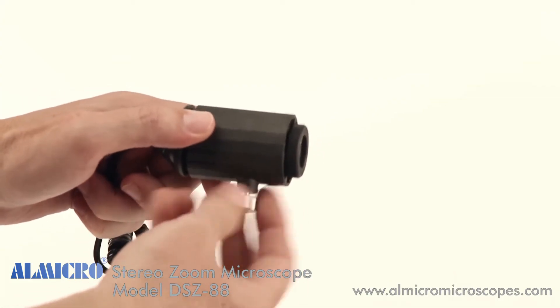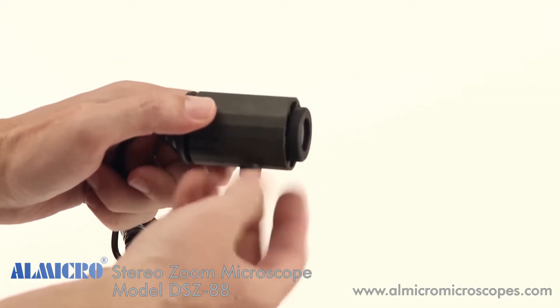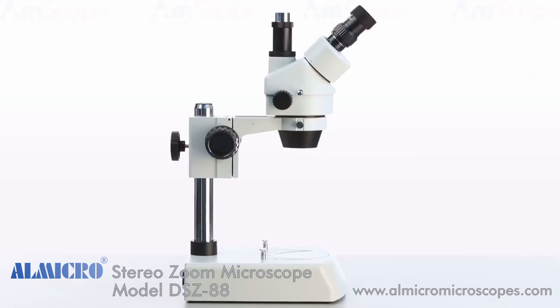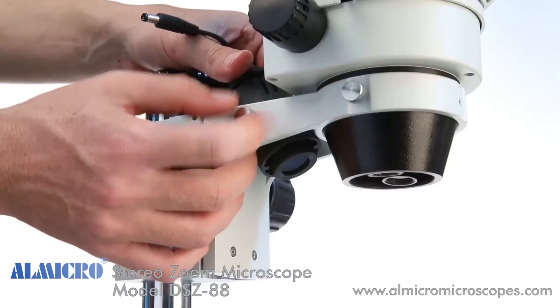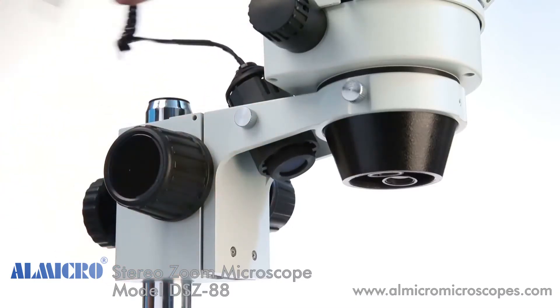Now we'll install the upper lighting module. Start by removing the locking screw. Insert the lighting module in the space behind the collar, then secure it with the light's locking screw. Then plug the power cord into the column's receptacle.